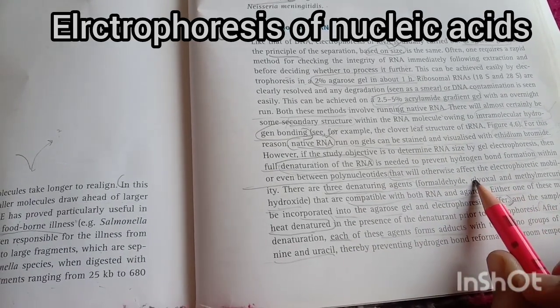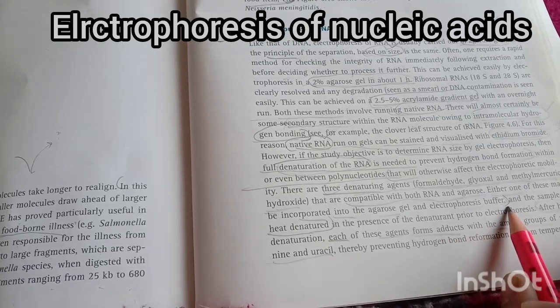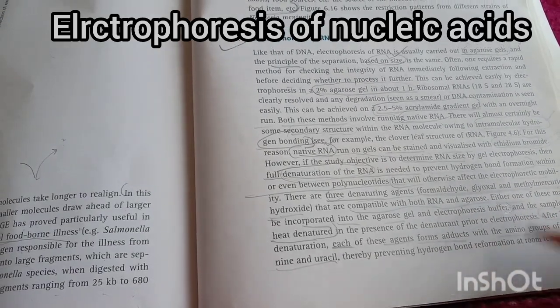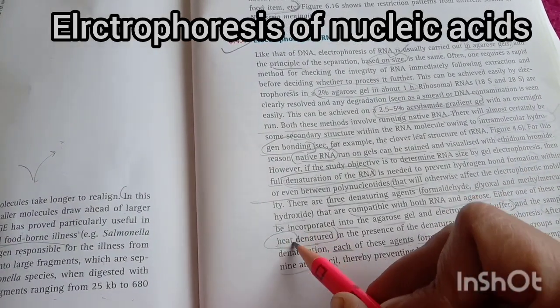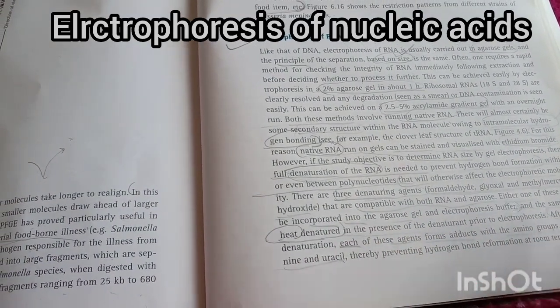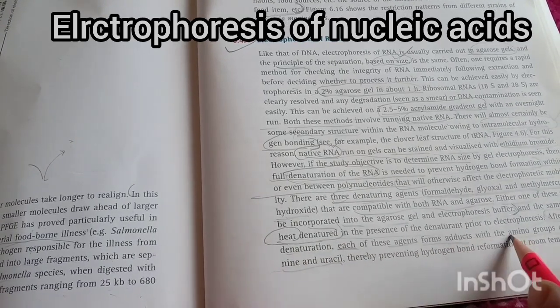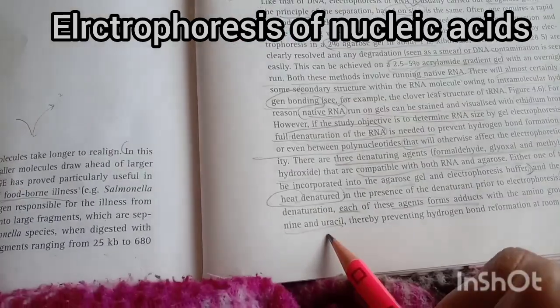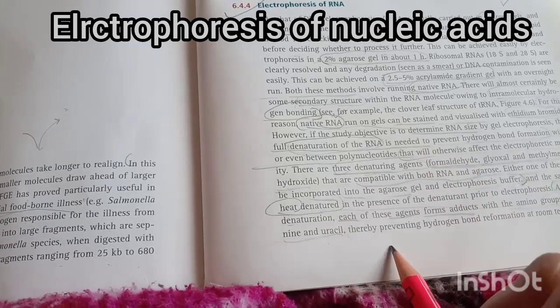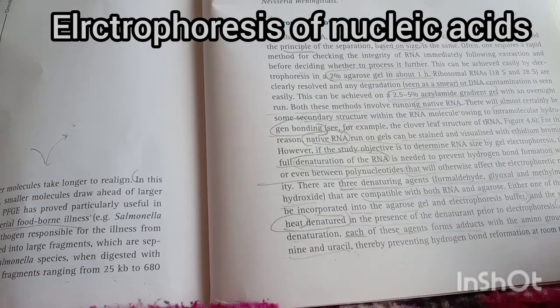Either one of these may be incorporated in the agarose gel and electrophoresis buffer, and the sample is heat denatured prior to the electrophoresis. After heat denaturation, each of these agents forms adducts with the amino groups of the guanine and the uracil of the RNA, thereby preventing hydrogen bond reformation at room temperature.